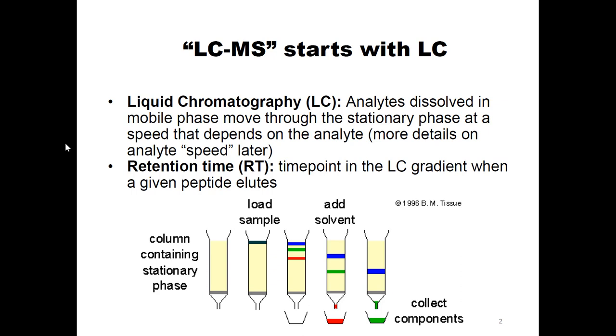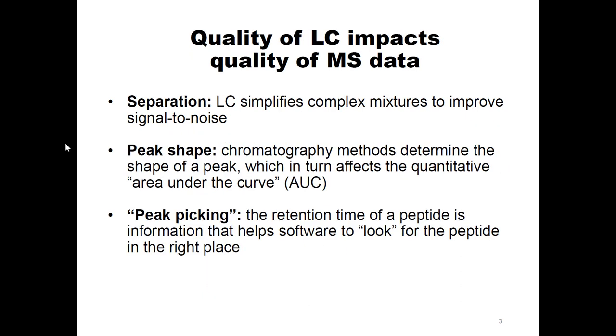So I wanted to establish a couple of these definitions because that's what we're going to be talking about for the next 30 minutes. There's three big reasons that you should be caring about your LC method and not just recycling whatever everyone in your lab uses. One is because liquid chromatography should simplify your mixture to improve your signal to noise. And every mixture is a little bit different, so every mixture is going to require slightly different tweaks to the chromatography method. The second reason to care about this is the peak shape.